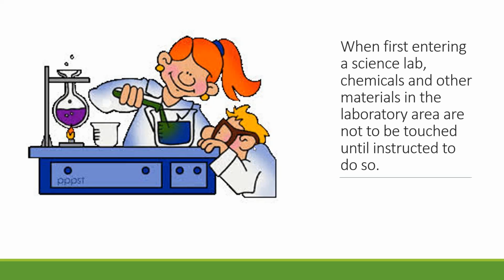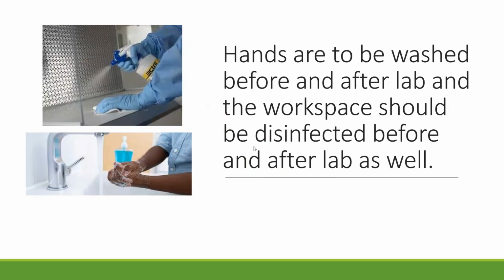So many times students will come in, they're going to put their materials up, etc., and then they're going to wait for the instructor to tell them what each and every chemical or each and every piece of equipment is, because understanding what you're walking into is one of the best things you can do to be safe in a lab. And that's a principle that you should know even walking into, as I said, working with a patient or somebody like that. You need to understand what it is that you are going to need to be doing.